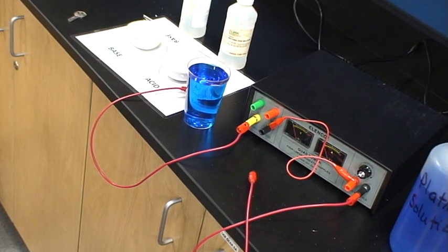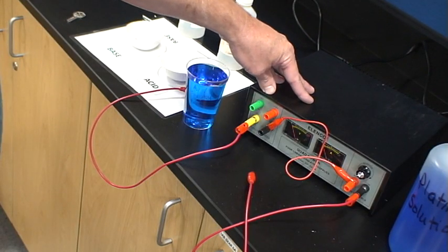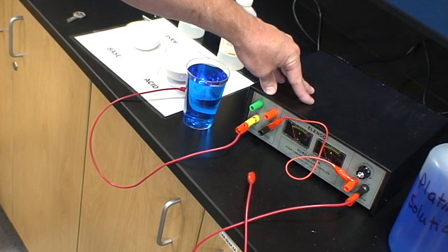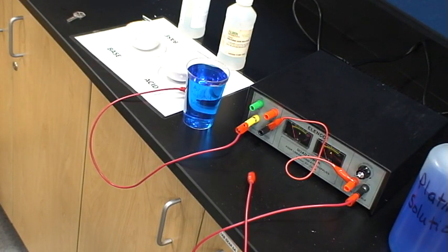Welcome back to AP Chemistry, everybody, and this is still Unit 5. We're taking a look at electrochemistry, and to this point we've always been taking a look at one part of electrochemical cells, and those are your voltaic cells, otherwise known as galvanic cells. Those are the spontaneous types of reactions. Now you'll notice that in this particular experiment we have a power box because we're going to be looking at another type of electrochemistry which involves non-spontaneous reactions, and those are your electrolytic cells.